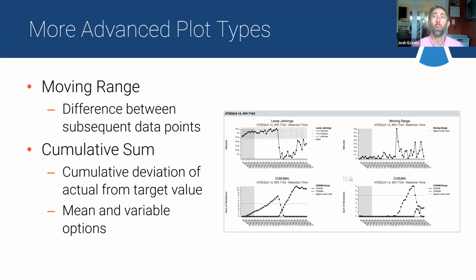And on that point, we have some Panorama users who, the first thing they do as soon as the service tech says, okay, your instrument's all set, I'm done, is they say, nope, don't leave. Let's run a couple samples through this system suitability analysis. And only when they get back to the normal range are they allowed to take off and sign off on the work being performed.